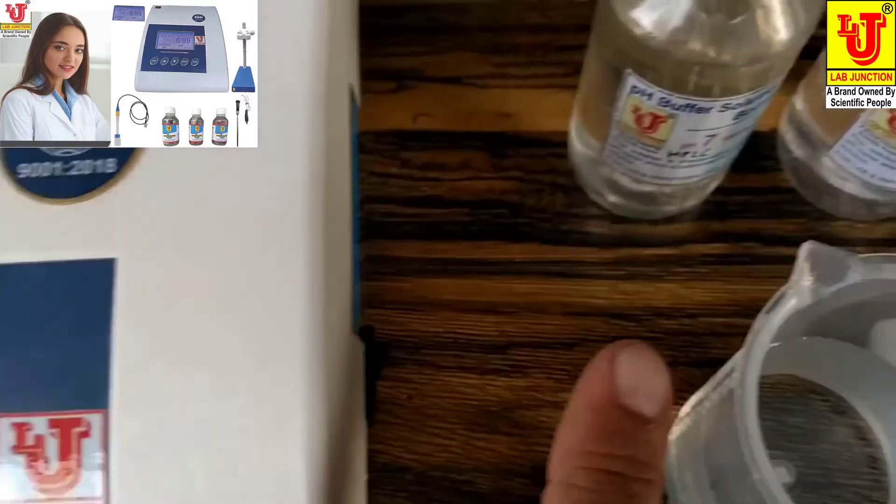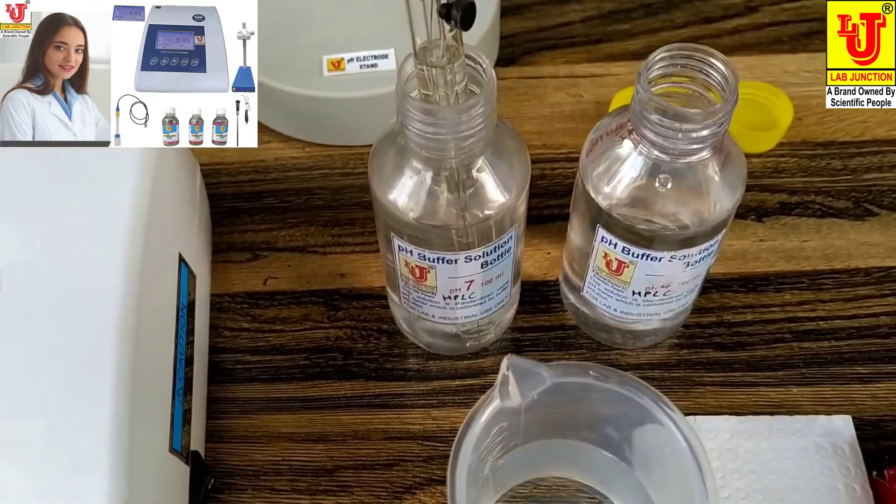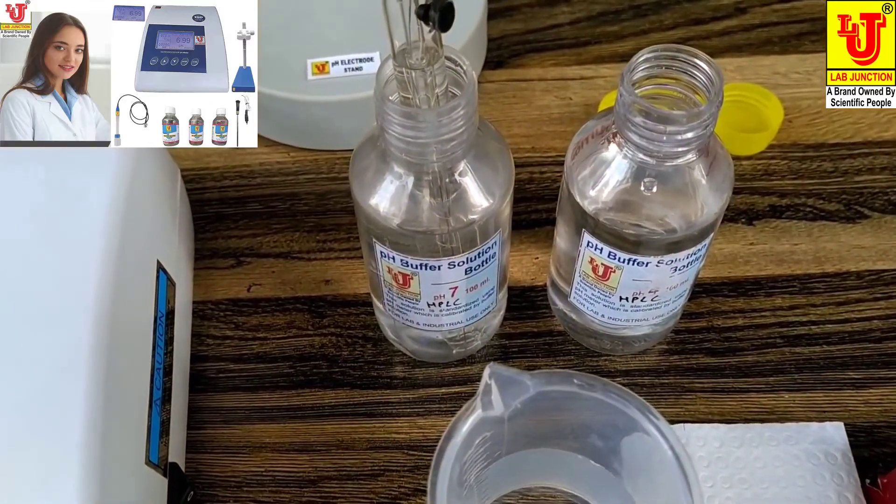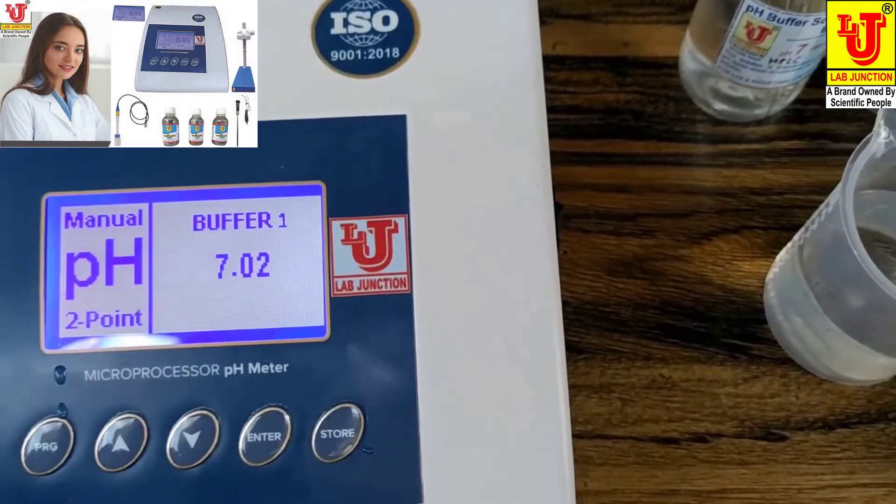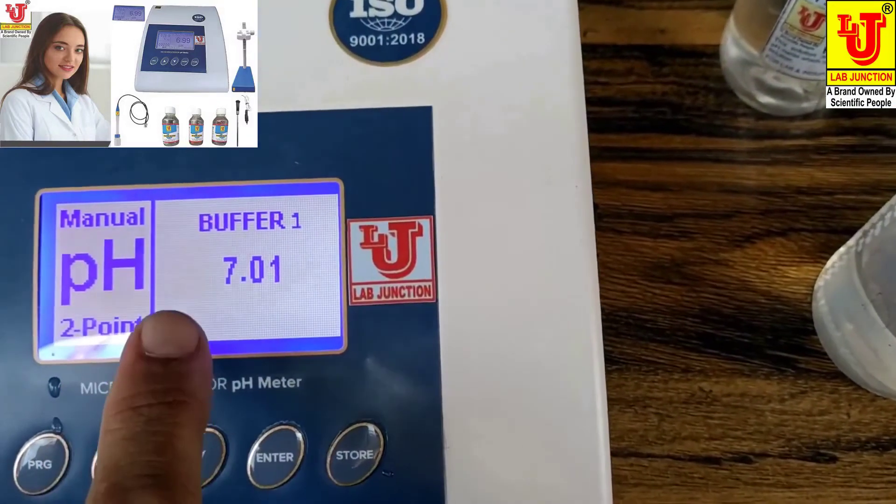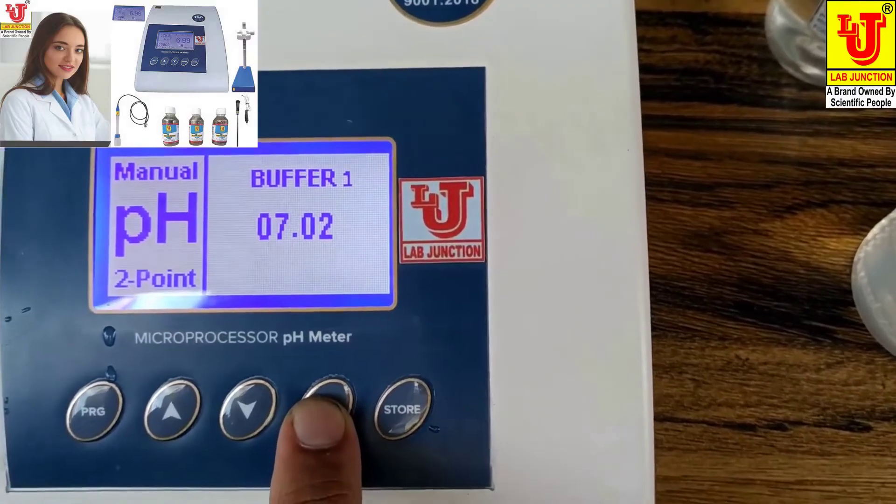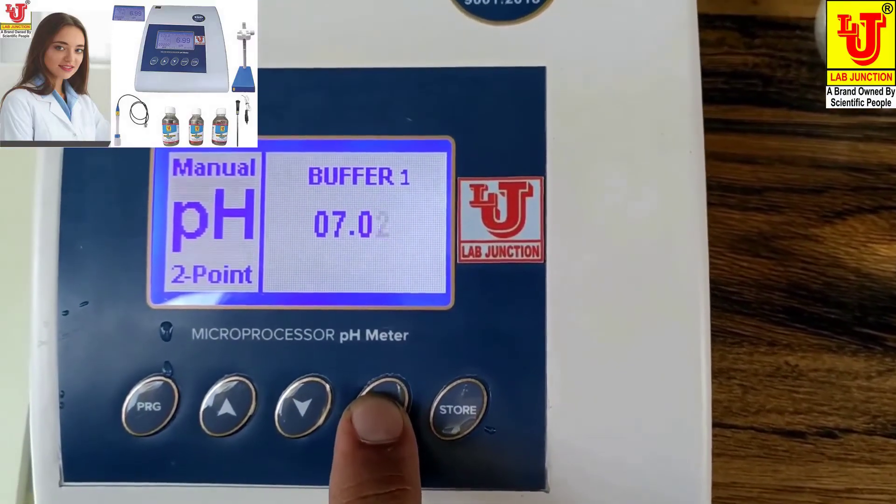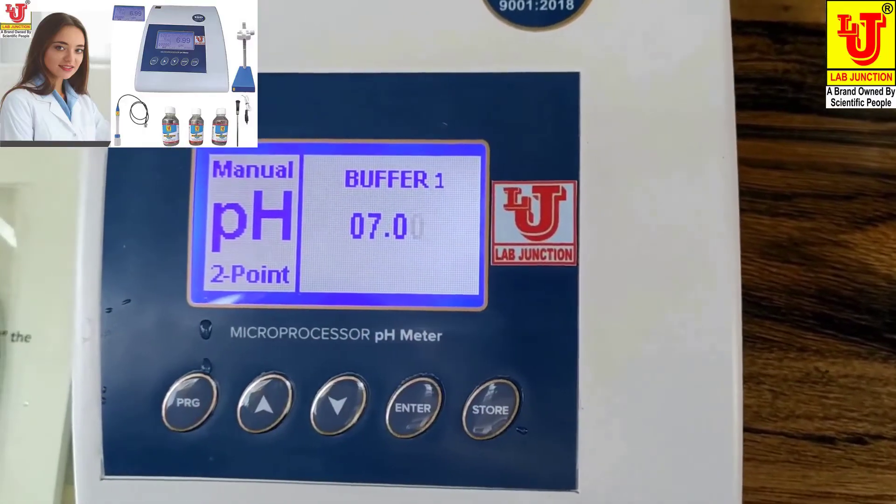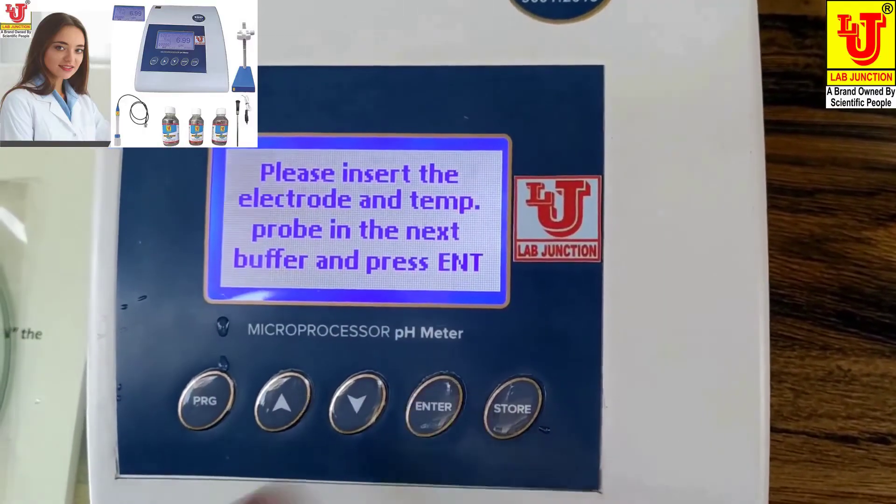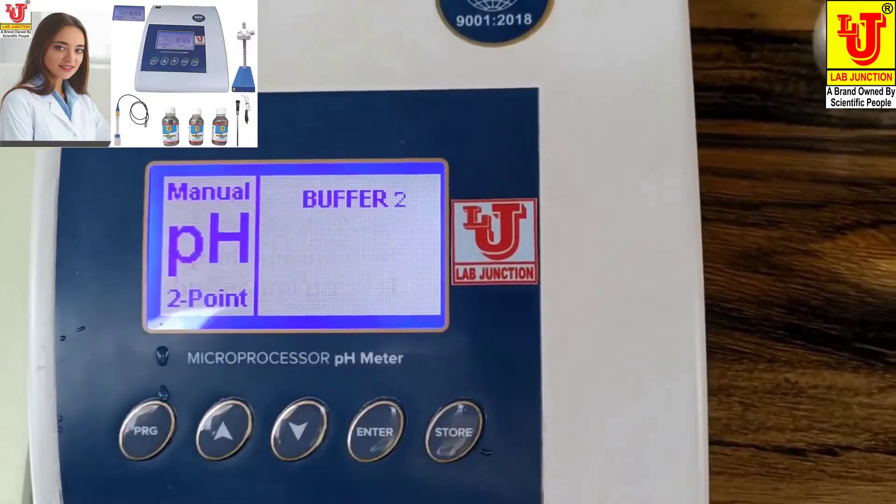Suppose this is 7.00 buffer, two-point. You want to feed your own value. Suppose this is zero, you go to next range. You set, suppose you want to 7.00, and press enter. 7 is calibrated. Now you go to buffer 2.